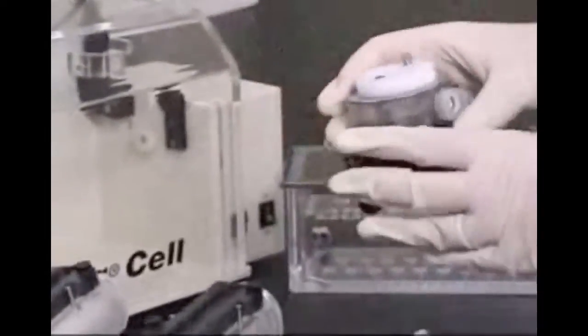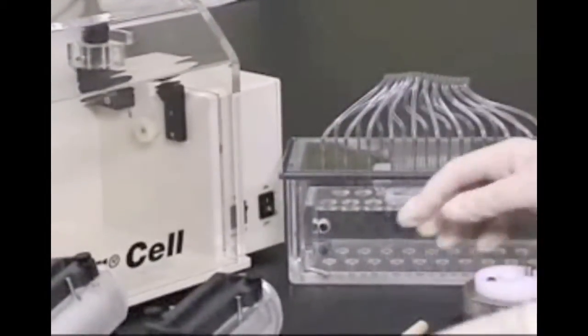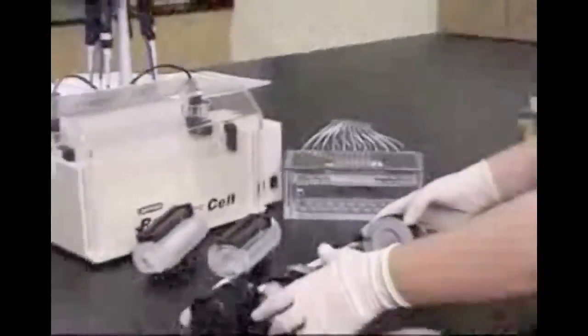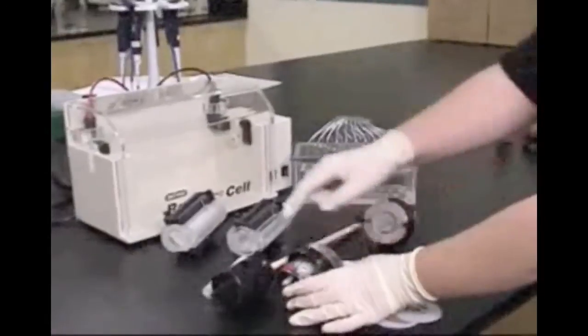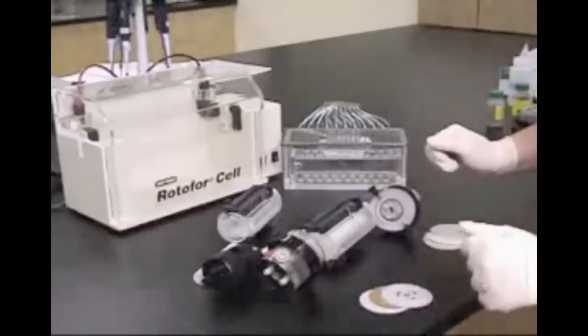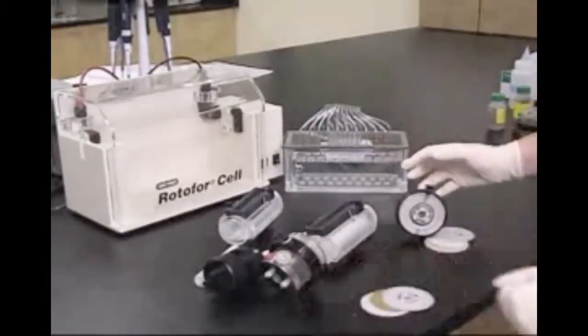The assembly procedure is identical for both the standard and mini Rotofor. First, the anode chamber is placed onto the cooling finger, followed by the focusing chamber, and the cathode chamber is added last. The cooling finger is then attached to a recirculating water chiller.